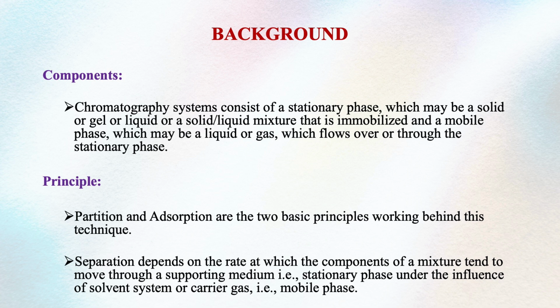Okay, for example, if this sample is able to mix and move along with the stationary phase, the result will be somewhat different. And similarly, if the sample is able to mix and move with the mobile phase, the result will be different. However, broadly, the major principles are, one is partition, another one is adsorption. Let us know more about these two techniques.